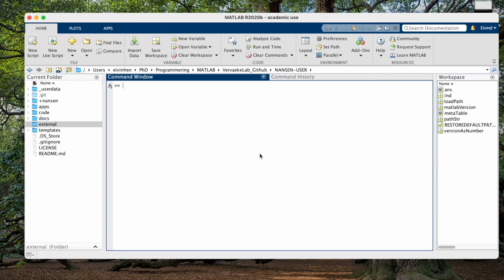In this video I will walk through the Nansen setup procedure. It might be a good idea to watch the video on the Nansen application first, because it will show you where we want to end up.